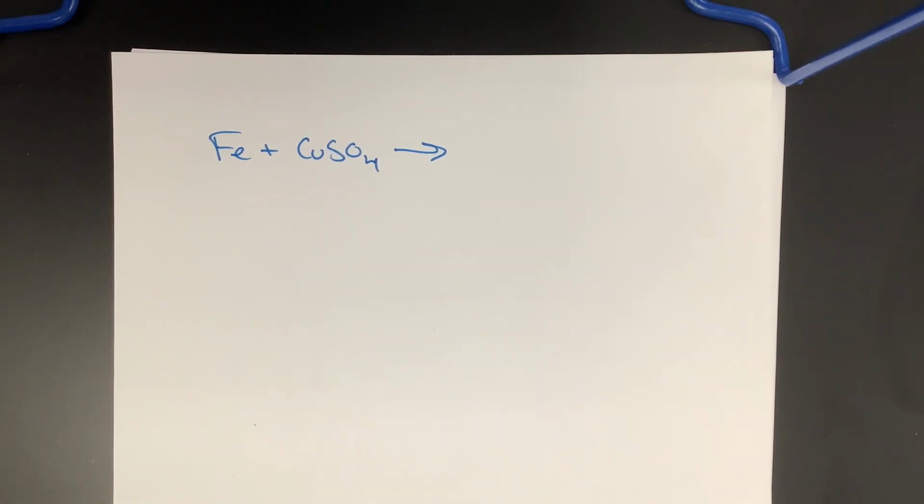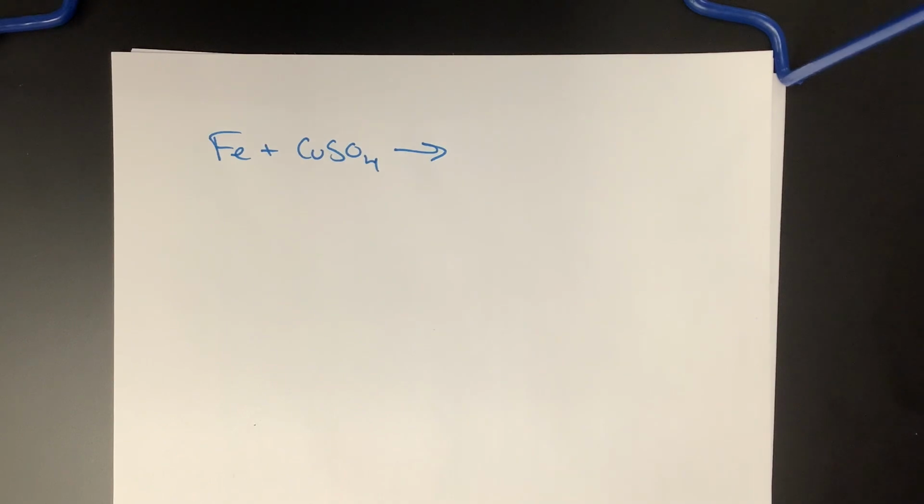But a chemical reaction is happening, so there's something different being made from those two reactants other than what we put in. And we can see that when we look and we see that the solution's a little bit different color, especially right next to the nail. Did you see how it's kind of like growing fuzzies on the nail? Did you notice that? Yeah or no? Either way, when we wrap it up here, which hopefully we'll have enough time. I think we should have enough time for other demos. When we wrap it up and you're leaving, make sure to come look at this again.